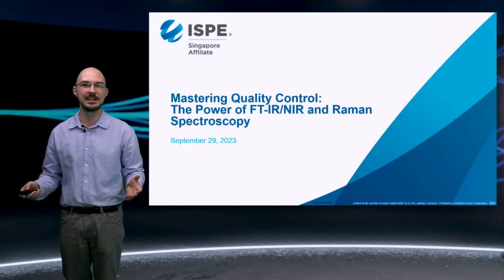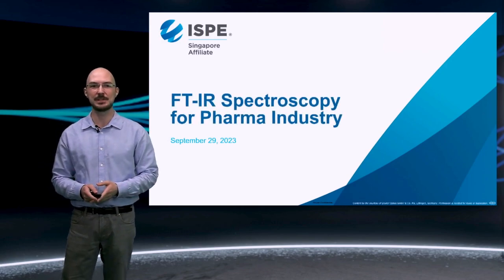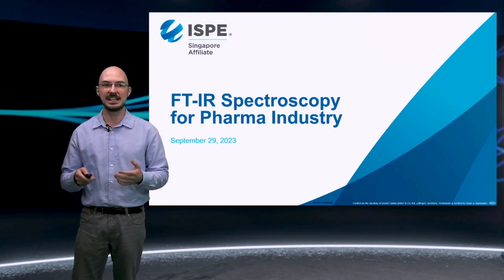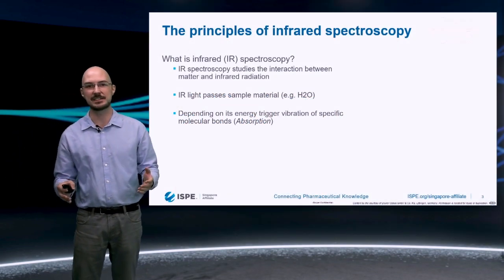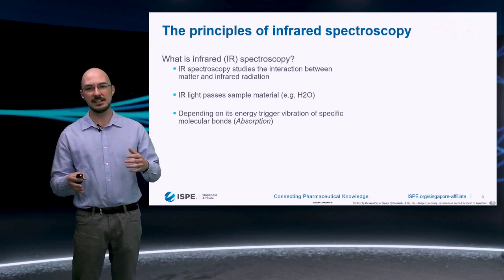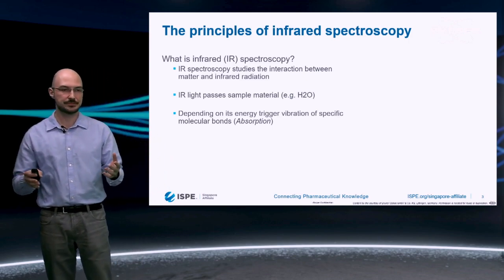Hello, good morning, good afternoon, and welcome to the first part of our webinar today: FT-IR spectroscopy, and how it will help you in the pharma industry and ease your life. So first, the basics, the principle of infrared spectroscopy. What is infrared spectroscopy? It's the study of the interaction between matter and infrared light.